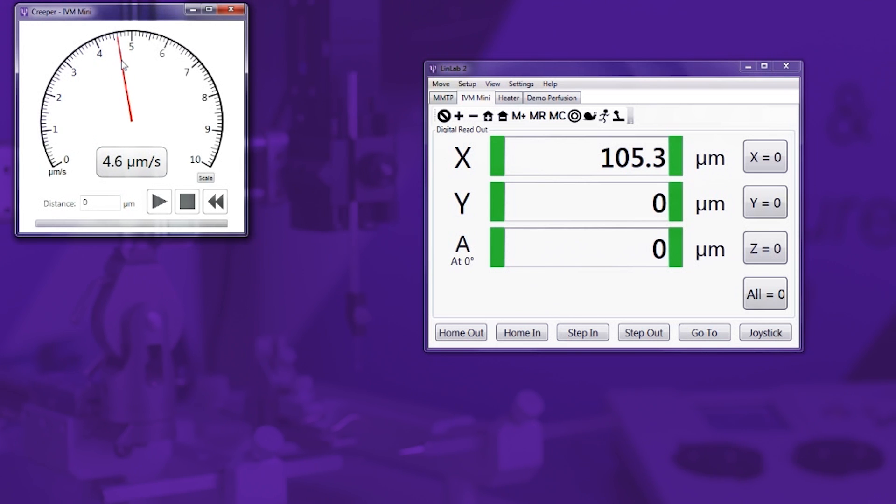Linlab's unique creeper function minimizes tissue damage when penetrating deep into your sample. This function allows the probe to creep to a desired position at a predefined speed much more smoothly, slowly and reliably than adjusting by hand.